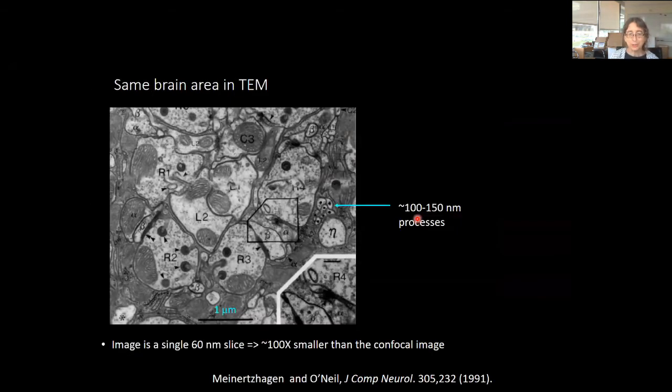And how much other stuff is in the tissue. So to see how much other stuff is in the tissue, you want to go look in electron microscopy, where you've labeled everything. And I think that all fluorescence microscopists should look at an electron microscopy picture at least once a month to remind themselves that the tissue is full of stuff that you're not labeling.